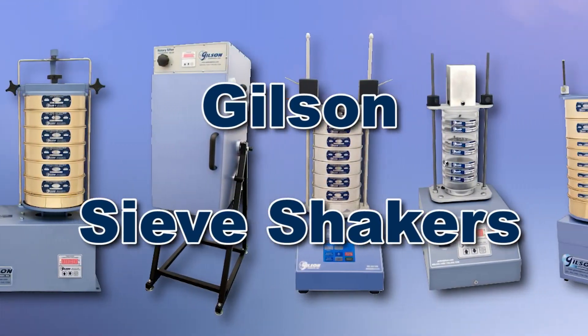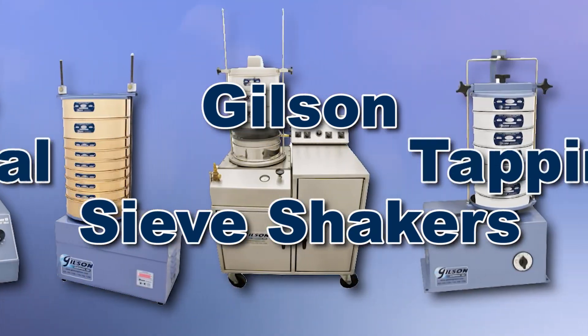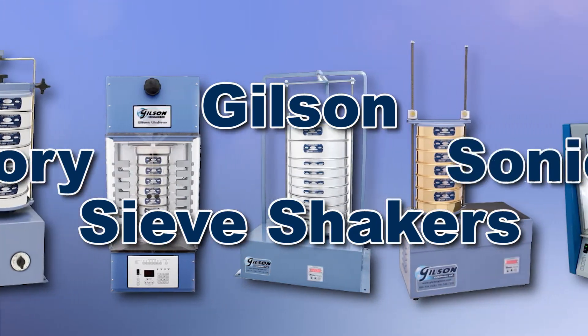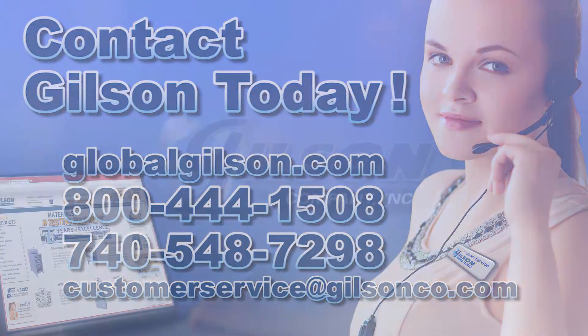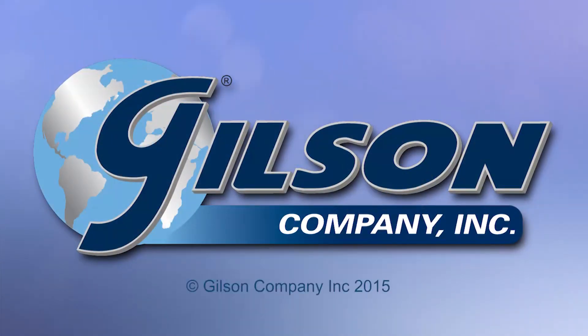With Gilson's complete family of sieve shakers offering a wide range of performance, features, and capacities, Gilson has the right equipment to fit your needs for fast, accurate, and reliable sieve analysis. Be sure to check out these and all our sieve shakers listed in the Gilson catalog and on the Gilson website. Gilson — your industry leader in material testing equipment.